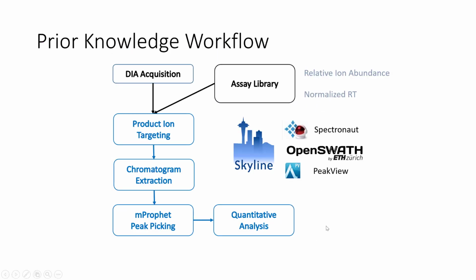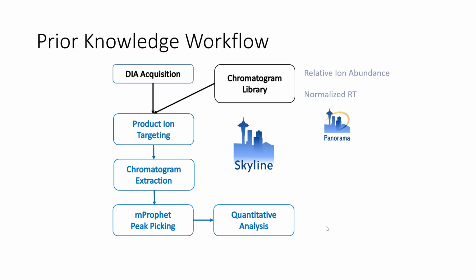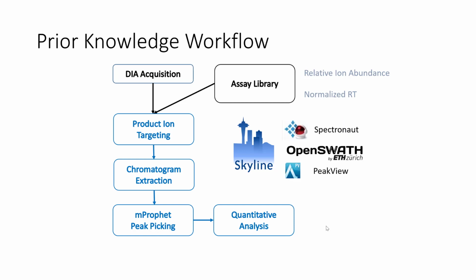So anyway, we have these two, and then there's this third thing, this chromatogram library we've talked about, and certainly EncyclopeDIA produces them, but we're not really going to treat that here.